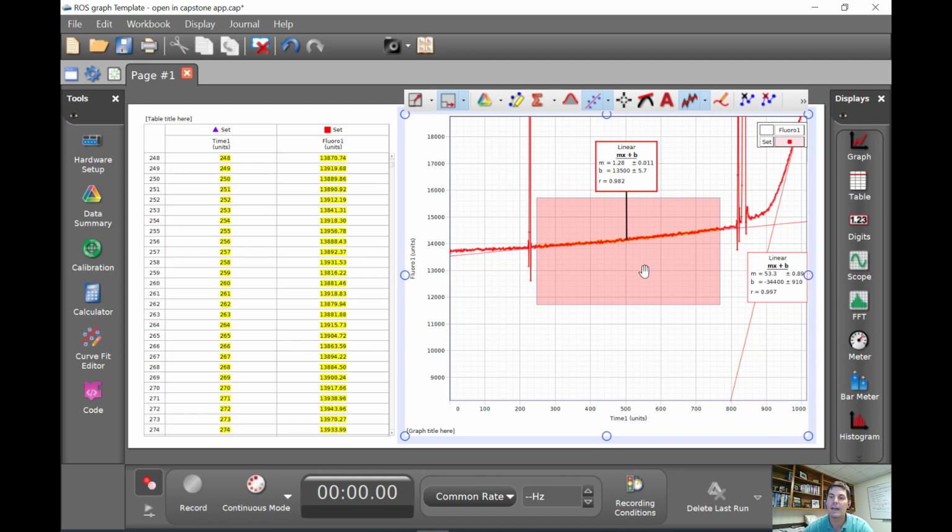So one of the things that we asked, that may not make super sense, is there is some objectivity to this. You should be able to have all the data points, but it's also subjective. You also want to kind of look at this data and see. So you can see this red line is the slope, and you want to see that that mostly matches. This one is a relatively easy one.